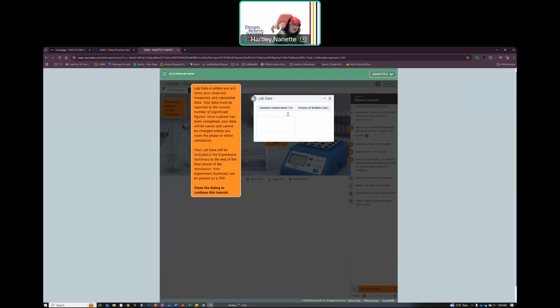It's supposed to be written in blue pen, not black. That way we can tell the difference between the original and a photocopy that might be made from that. It's not supposed to be written in the fun colors that I like to write in, like pink and purple, because that's not a professional color. Okay, so it should be professional documentation.